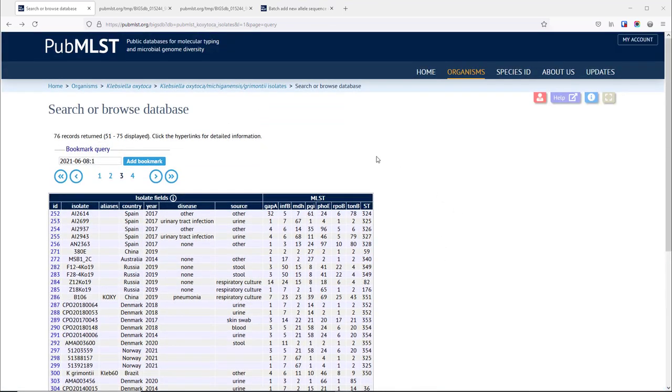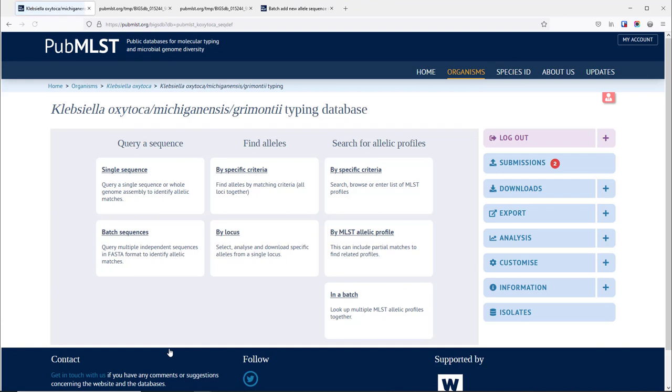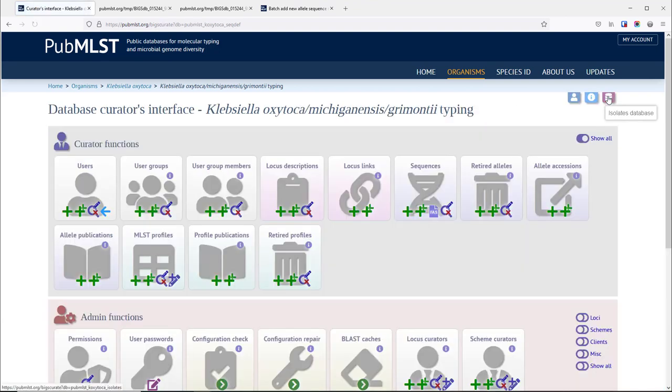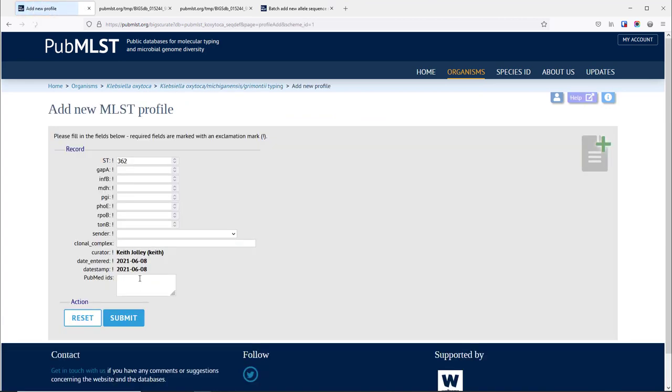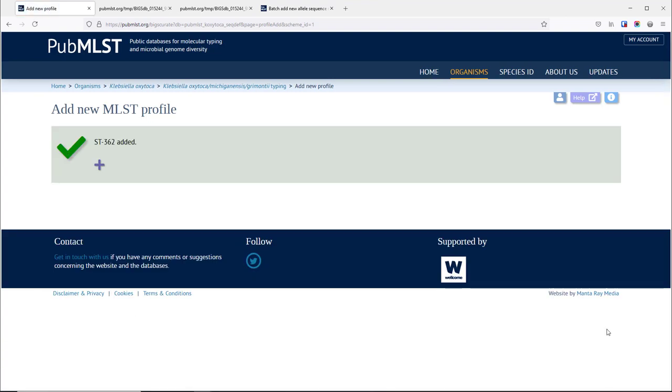We can do that by going to the typing database, going into the curator interface and then selecting a new MLST profile and then we can enter the allelic profile there. It's also possible to do this in a batch mode. We enter the profile in, include the sender who sent the actual genome and that's it. The profile is added to the database.